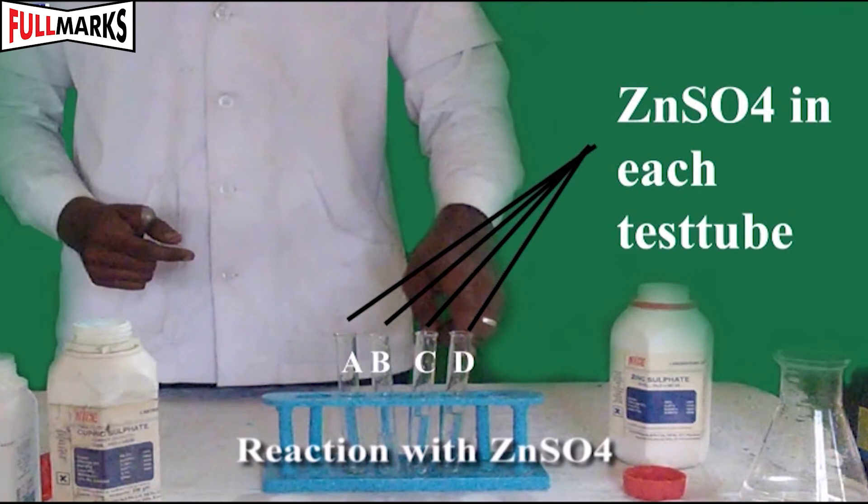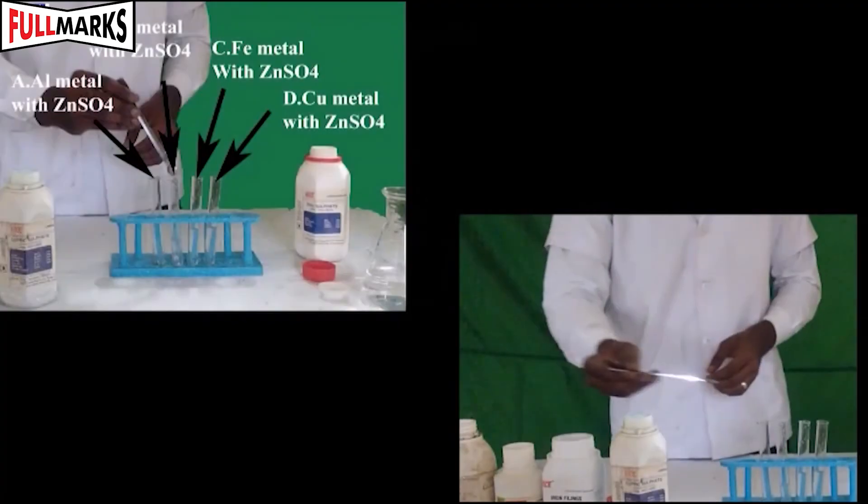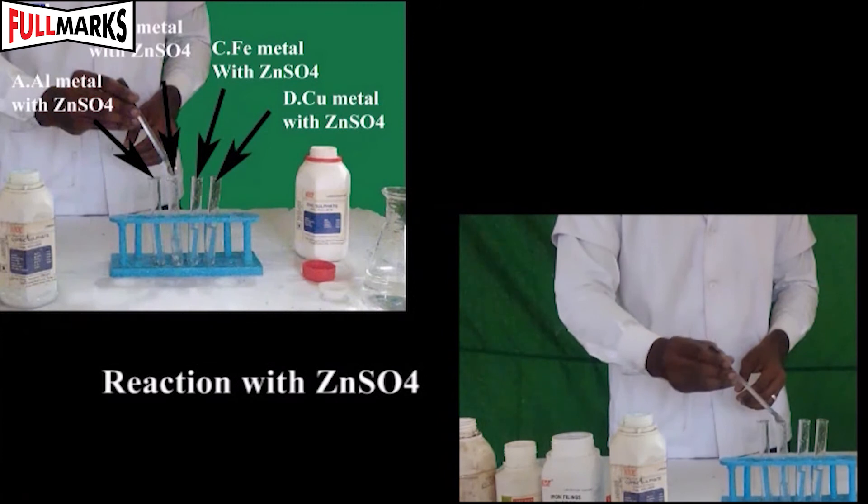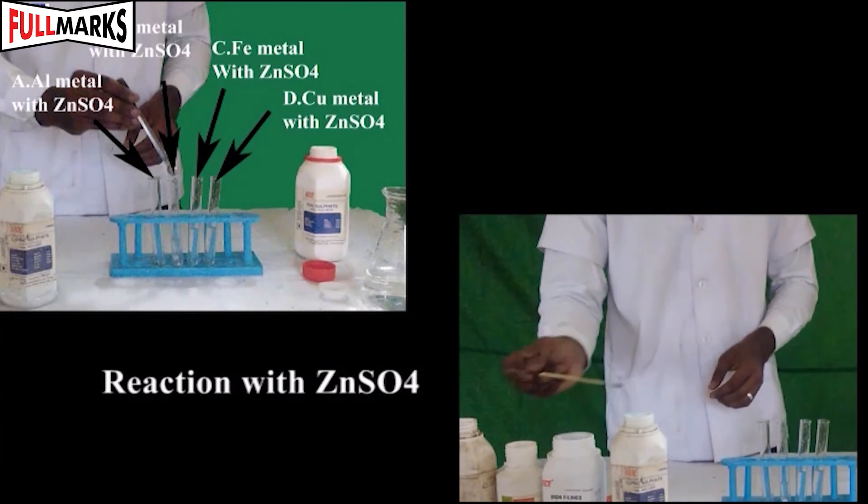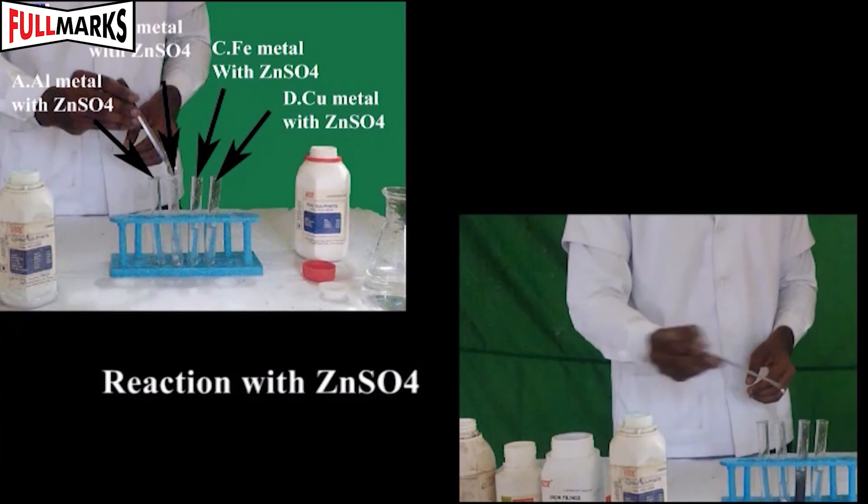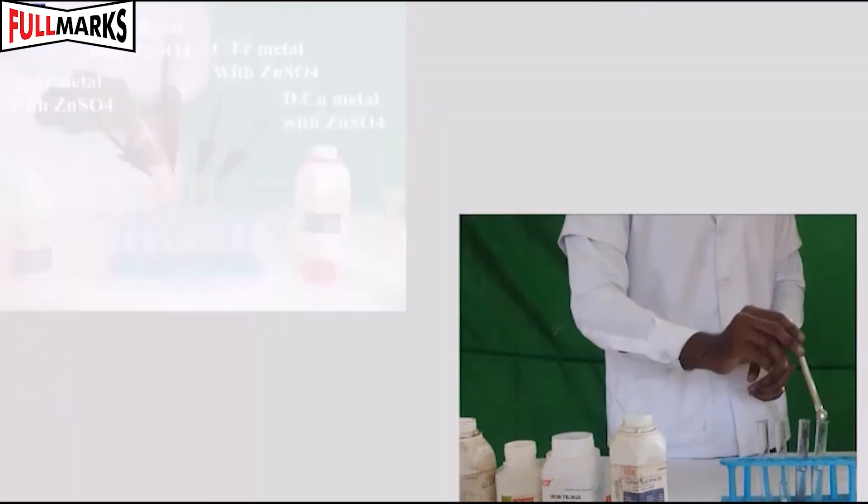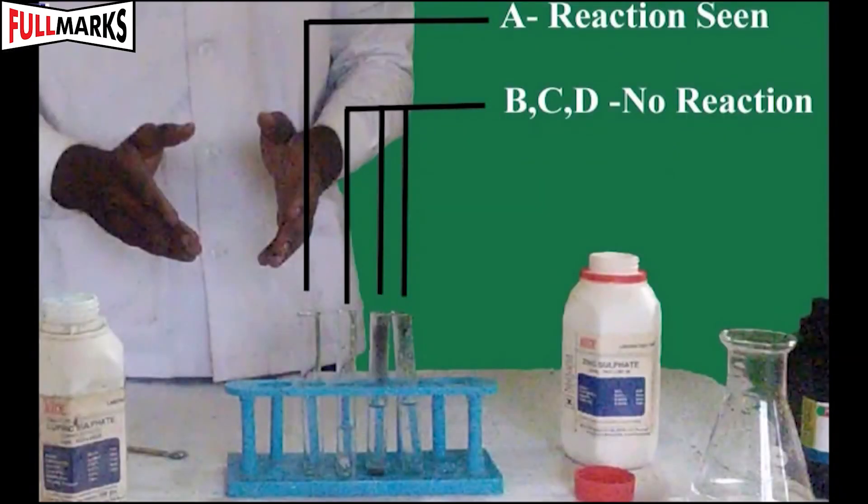Reaction with ZnSO4 solution: Add zinc sulphate solution in each test tube. Dip the small clean pieces of aluminium, zinc, iron, and copper metal in each test tube respectively and record your observations. In A, there is a reaction seen, but in all other test tubes B, C, and D, there's no change and no reaction taking place.